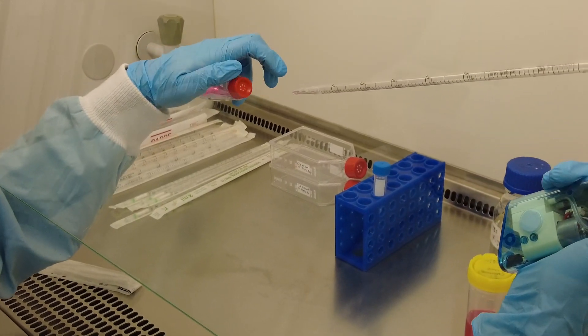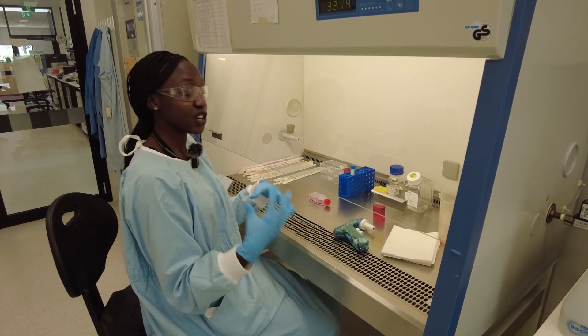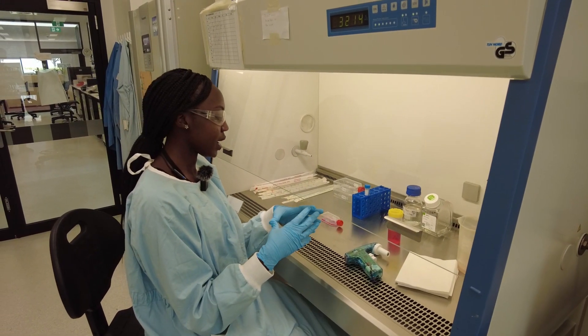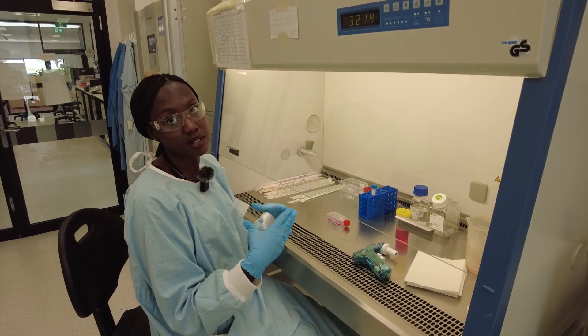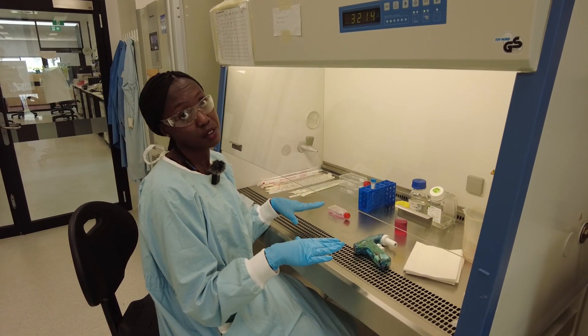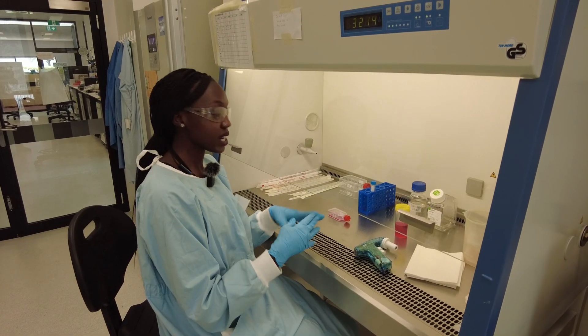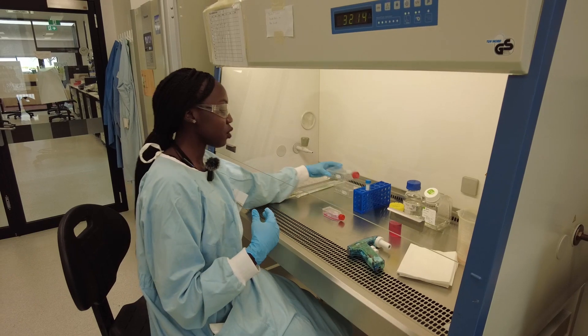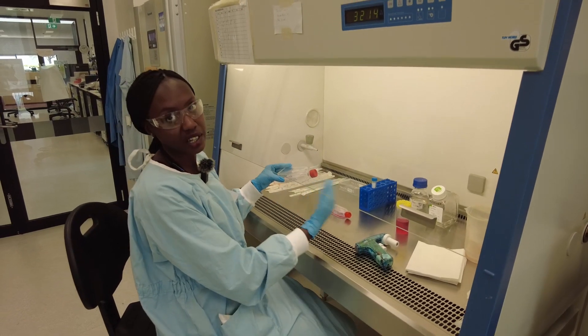Our cells like to grow clumped up together, so we give them a small surface area to grow in because they like to grow together. When the flask is completely filled, then we put trypsin and we lift the cells and do the same procedure — we centrifuge the cells, then expand them and put them in a much larger flask and we continue.